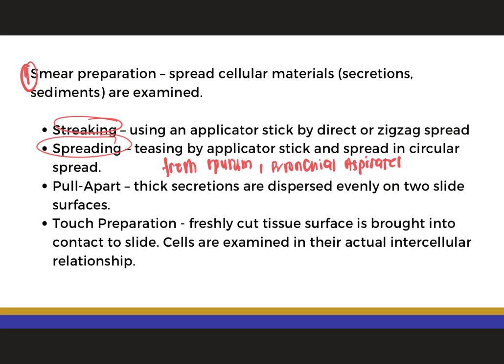And also for thick mucoid secretions. Please remember that spreading is a little more tedious than streaking but has the advantage of maintaining your cellular interrelationships of the material to be examined.